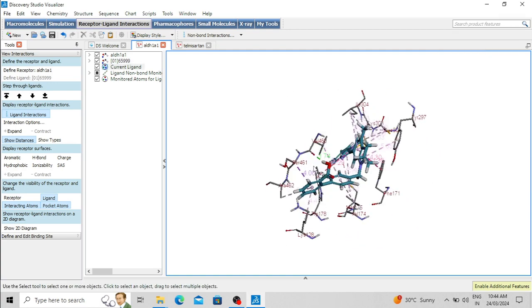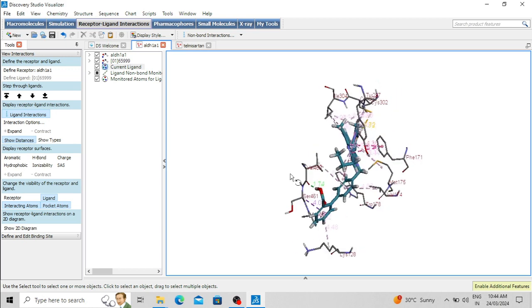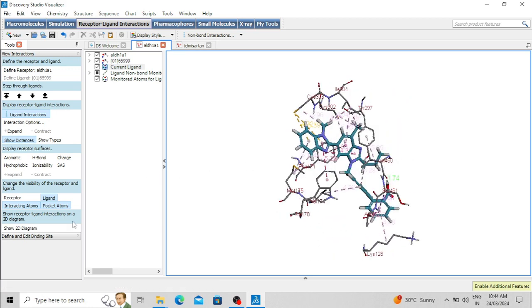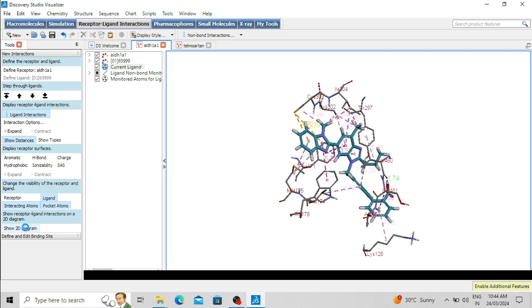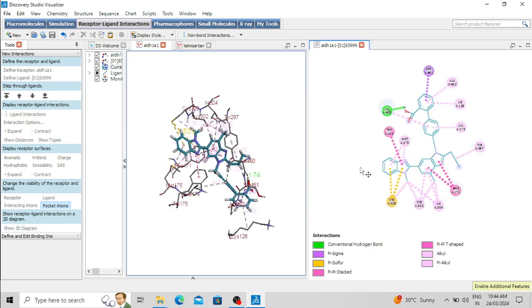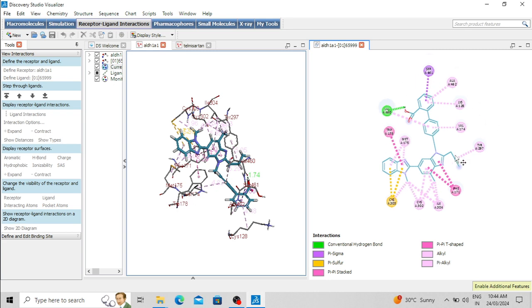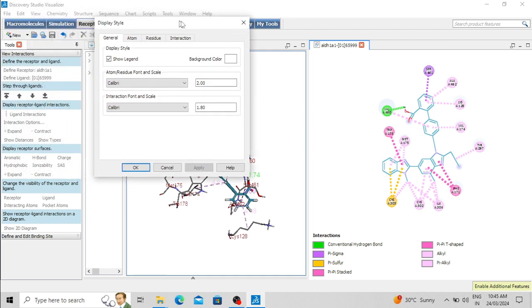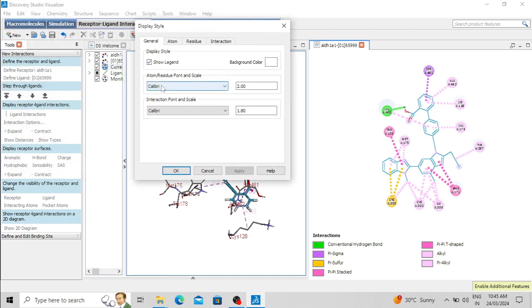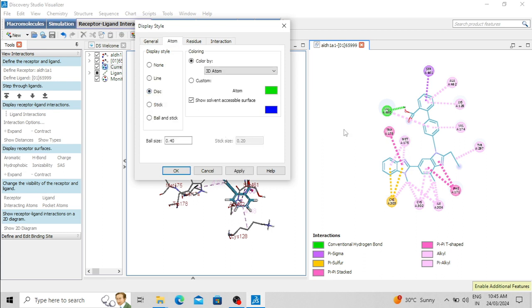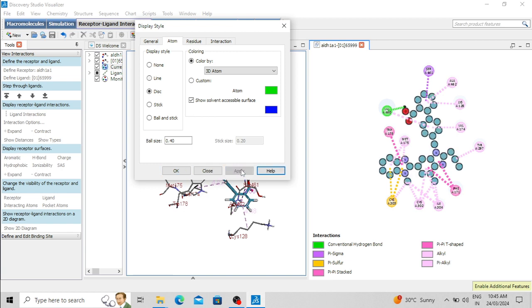One of the best features of BIOVIA Discovery Studio is the 2D diagram. Click here to visualize the 2D diagram — you can see a clear 2D interaction diagram. You can also change the display style of this 2D diagram, including the font and font size, and you can change the ligand display style as well.